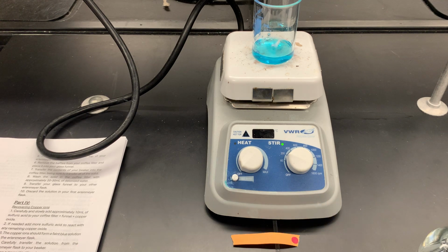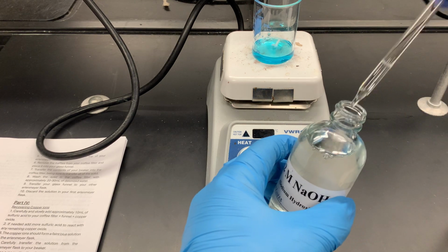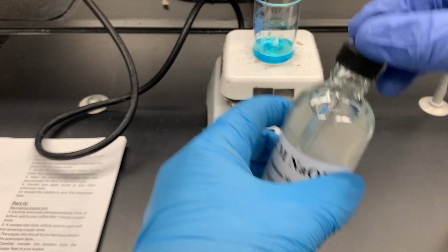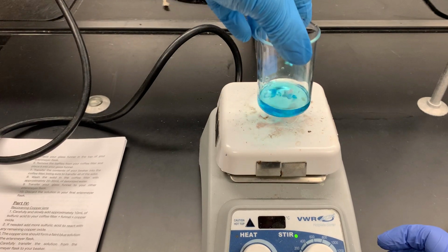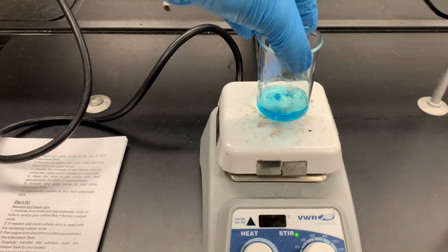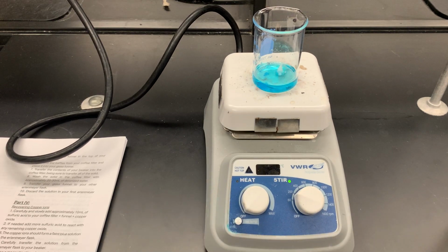What we want to do is neutralize that. And so what we're going to do is take this sodium hydroxide in a dropwise fashion, do 1, 2, 3, 4, 5 drops. Now, to see what's happened, if you look, there's a solid that has formed. That is copper hydroxide. So that is a solid ionic compound, an insoluble ionic compound.